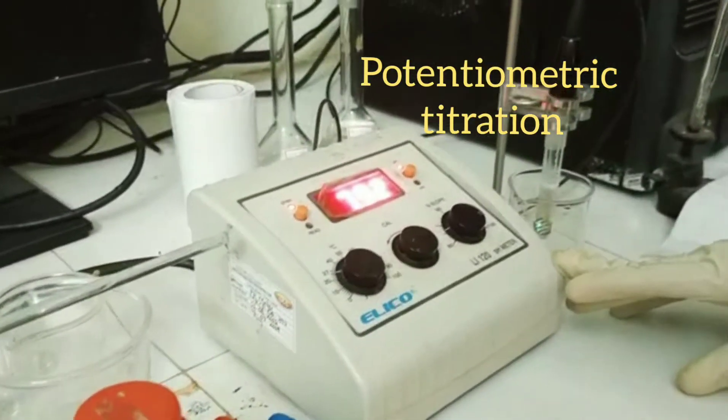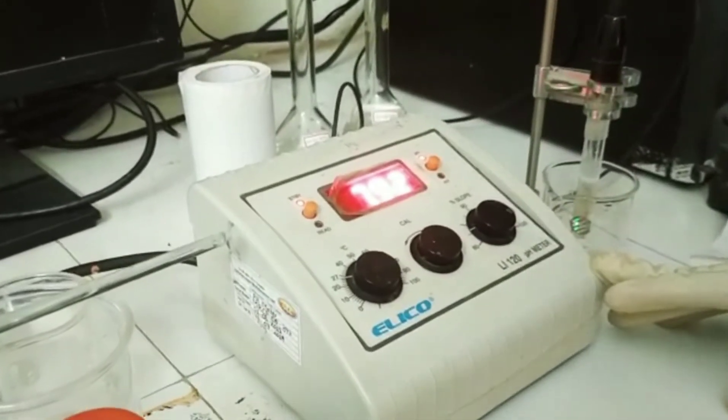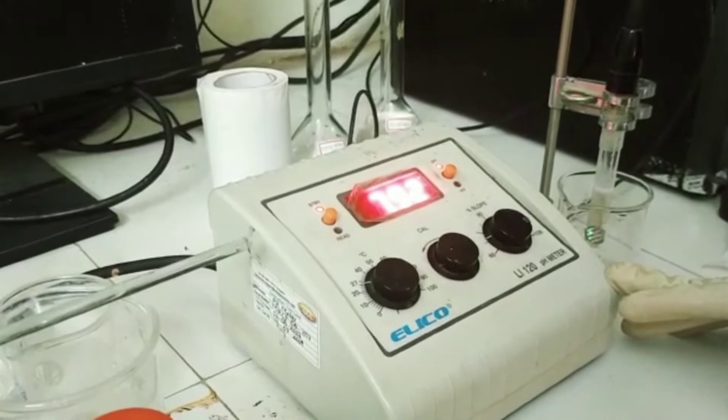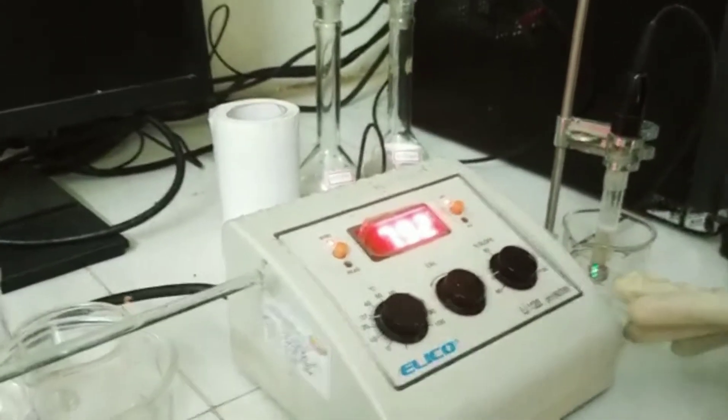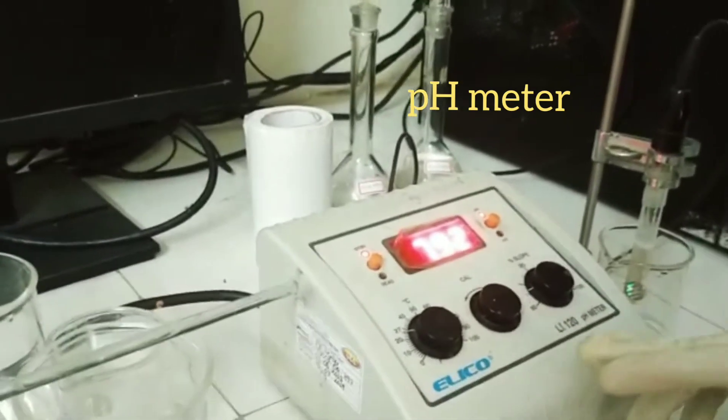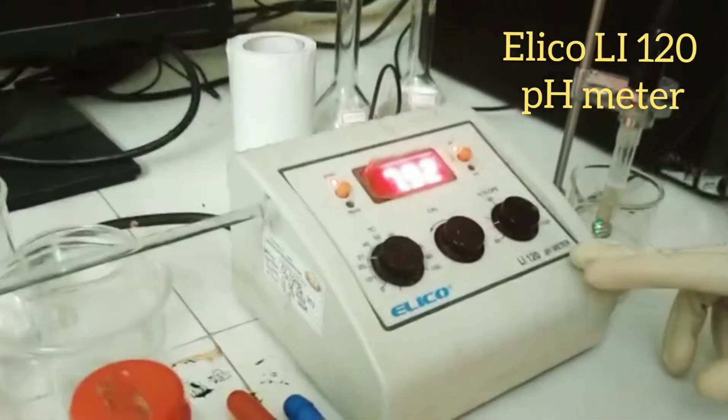Potentiometric titrations are usually performed by using a potentiometer. The same titrations involving the principle of potentiometry can also be performed by using the pH meter. So, today I want to demonstrate a potentiometric titration by using ELICO LI120 pH meter.